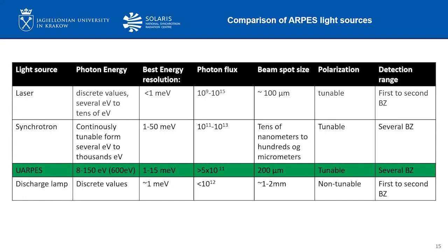Synchrotron-based ARPES has many notable advantages. First, by using a variable polarization undulator and a high resolution monochromator, the photon energy and polarization, linear or circular or other, of the beam can be readily tuned.